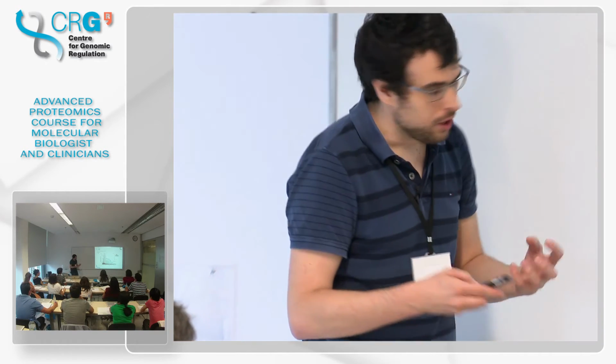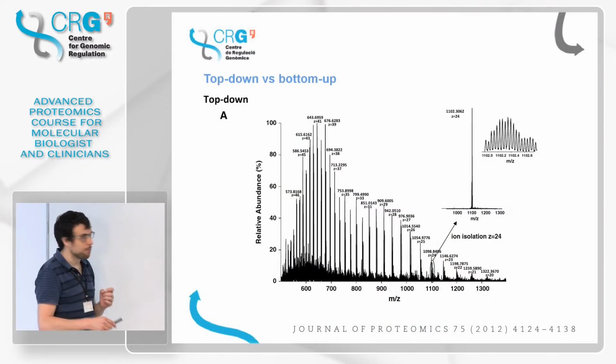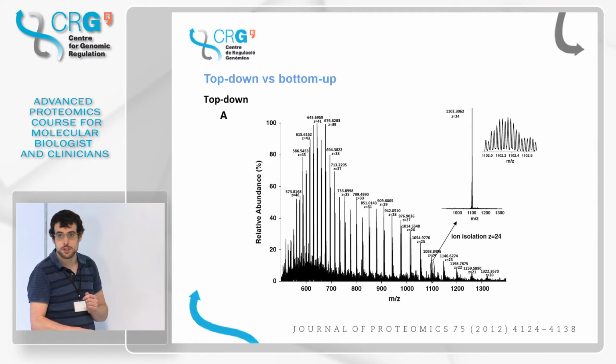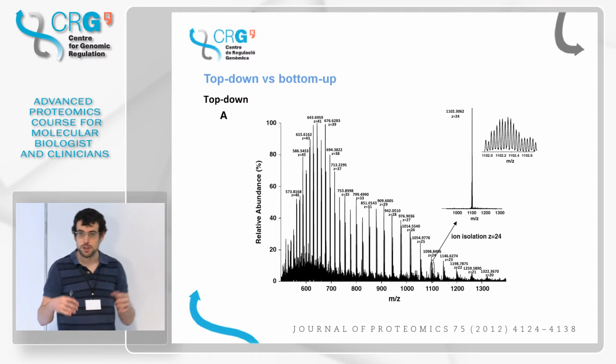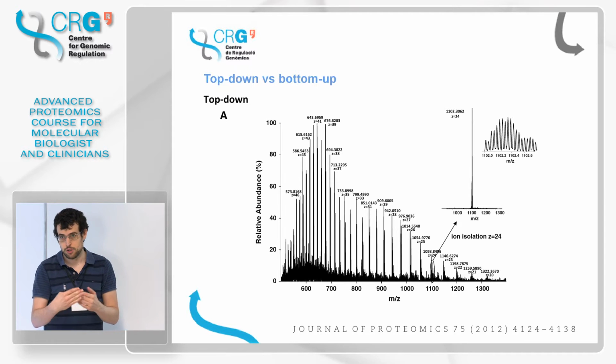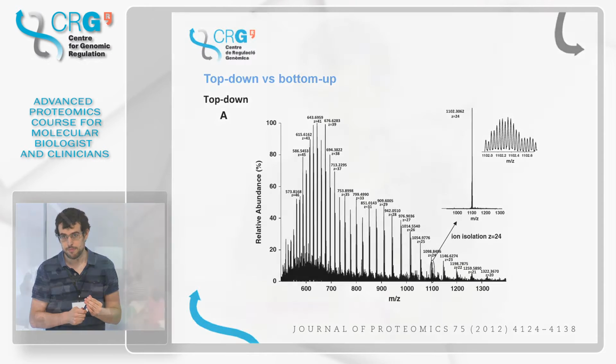Okay, so we are not limited because of the charge states. Because for example, this would be 30 kilodaltons, but actually what we are measuring is in the 700 mass over charge range because of this. Of course, the bigger the molecules are, the less efficient is the ionization and the ion transmission into the mass spec. And therefore, we have less sensitivity, because of this ionization problem.